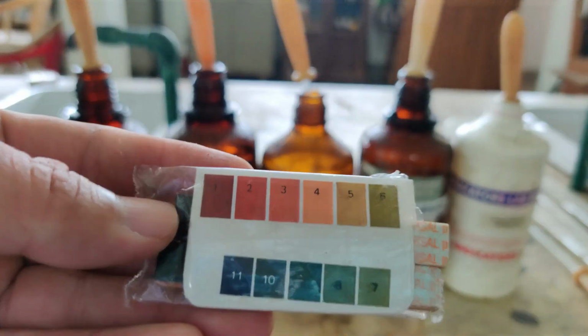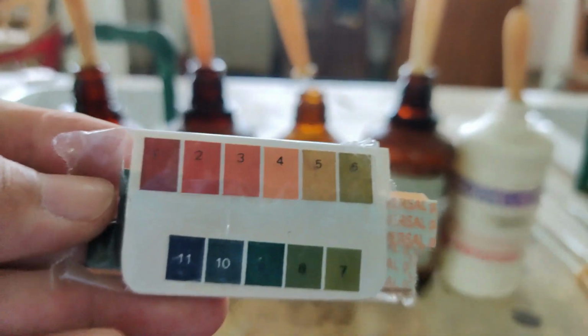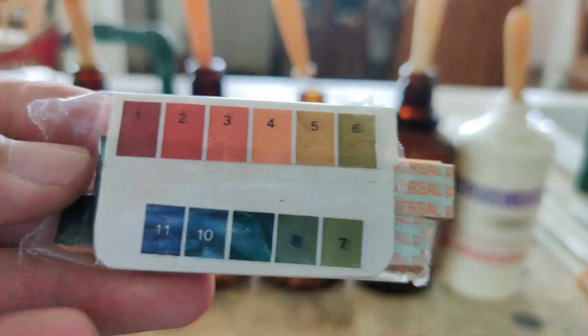I was talking about a different color paper. You can see since this indicator will only give you pH from 1 to 11, the number 1 has a different color, 2 is a different color, 3, 4, 5, 6, 7, 8, 9, 10, 11. This color chart actually comes with the packet only. You can see it came with the packet.